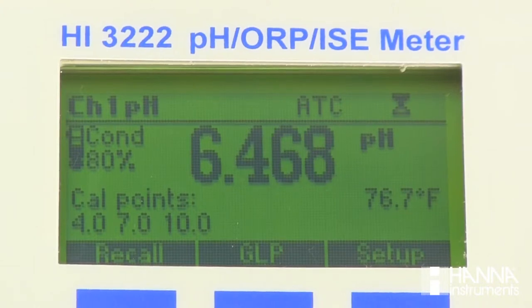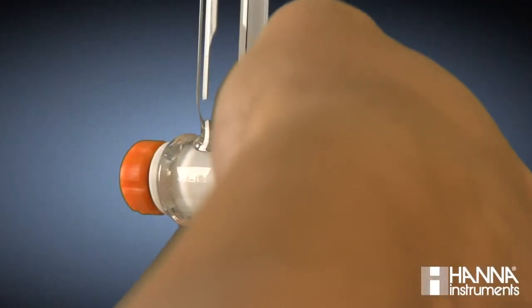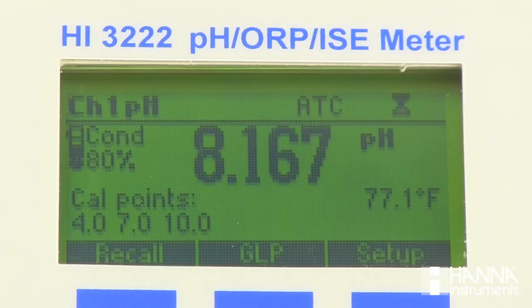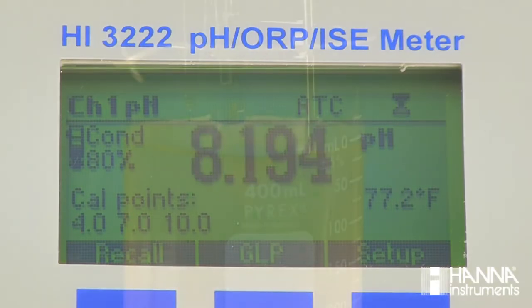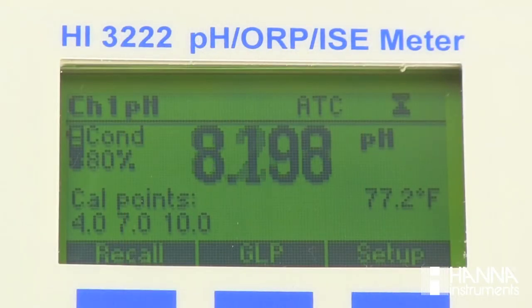Our pH begins to change more quickly with every titrant dose. At this point, we're going to begin to add smaller doses and wait for each titrant dose to completely react with the analyte before adding another dose. By doing this, we ensure that we're accurately detecting our endpoint and not overshooting it. As we can see, the pale pink color in our solution is sustained and our pH has become stable right about 8.2.